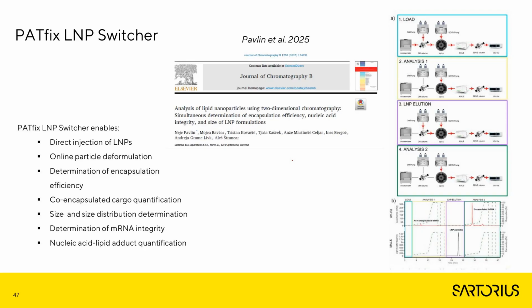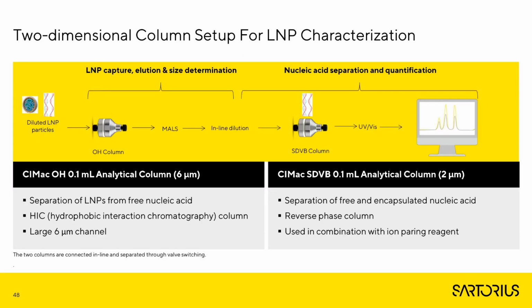If we have co-encapsulated cargo, as I mentioned before, we can separate the cargos from each other. We can determine the size of the particles. We can determine the integrity of nucleic acids. But additionally, we can also detect impurities like nucleic acid lipid adducts. So this is the setup.